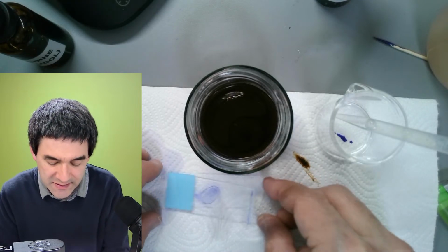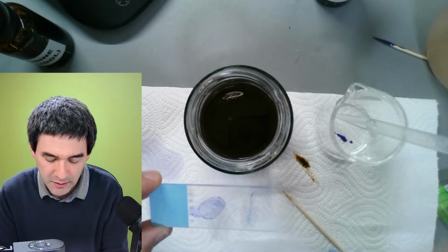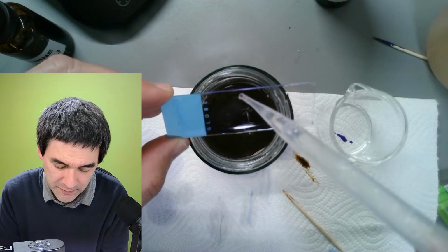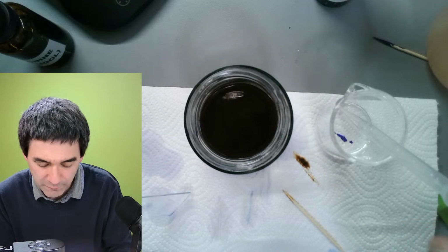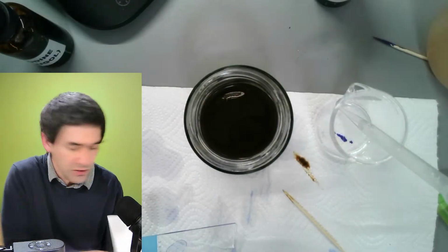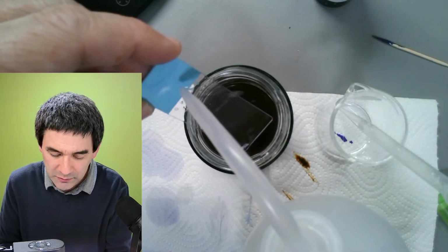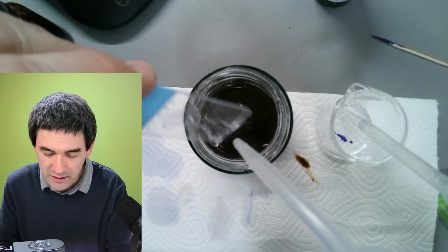The next step would then be, there's still something coming out here a little bit. I think that should be enough now, okay? The next step is the following. It says here, and then rinse immediately again. So I'm going to remove the alcohol again with a little bit of water. Okay, here we go.